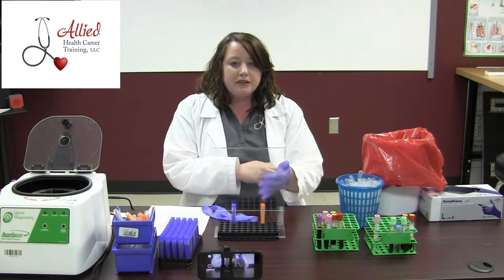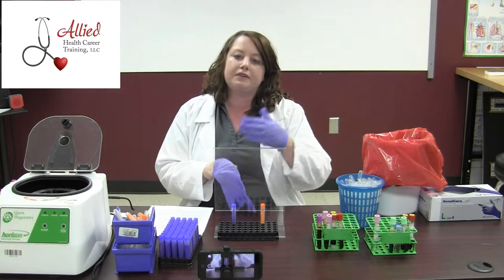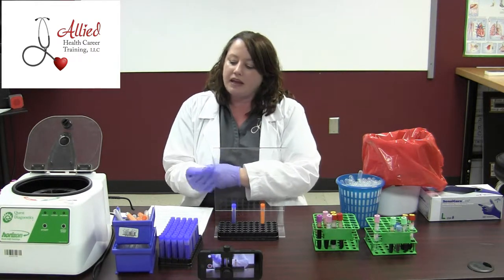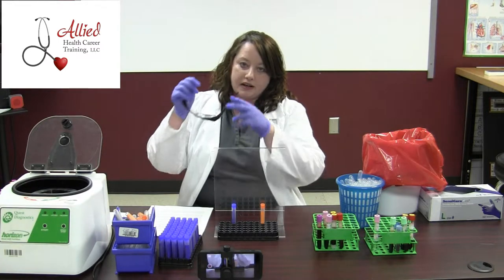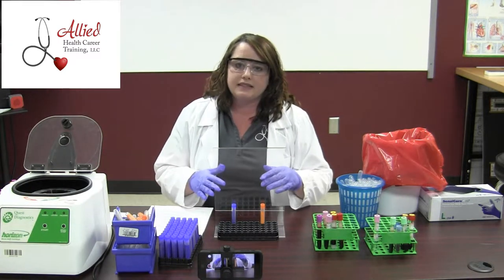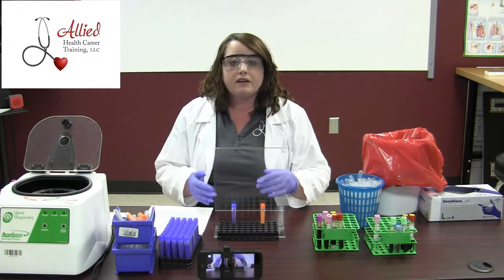Now in this process, we really might need to protect ourselves a little bit more. You kind of want some sort of barrier because there could be some splashing involved. Also, we're going to want to protect our eyes. It kind of depends on the facility about how much you're going to have to don and also how comfortable you are.